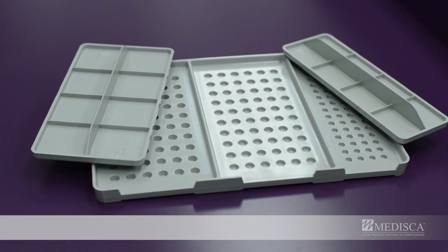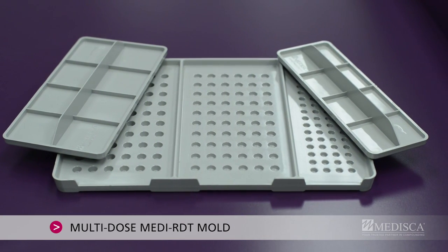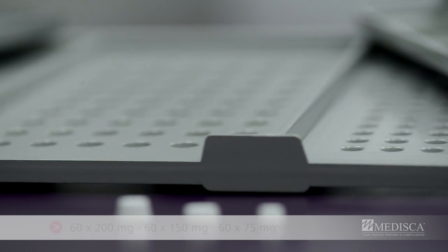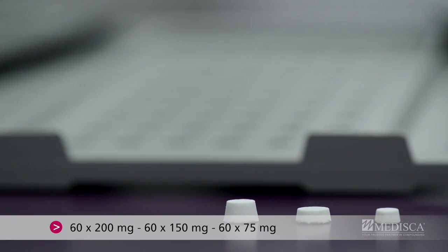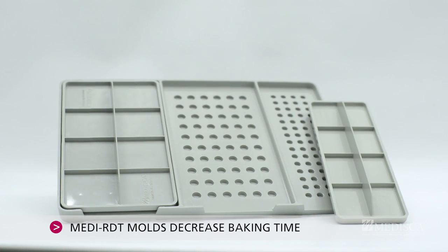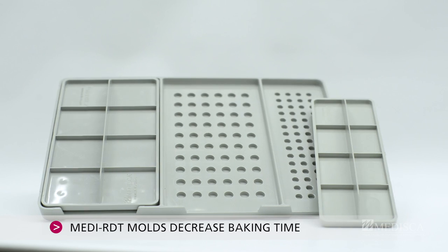Although not included in the kit, Medisca offers a multi-dose RDT mold, ideal for compounders requiring greater versatility and different dosage options. Our highly heat resistant Medi RDT molds decrease baking time, making your process that much more efficient.